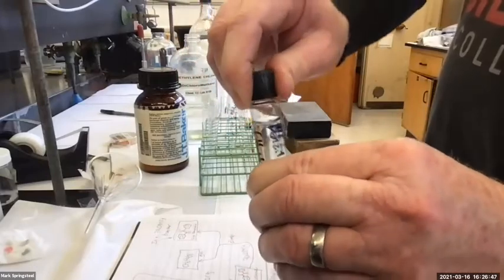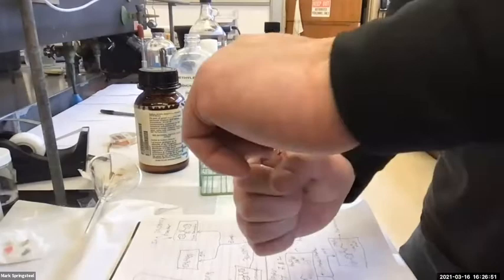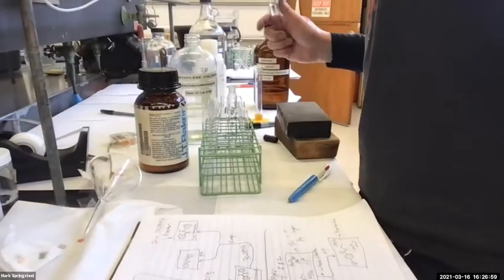I need to give it a slight tilt back, vent. Okay, looking okay. Feels like it's leaking a little bit. Maybe I grabbed the wrong cap.